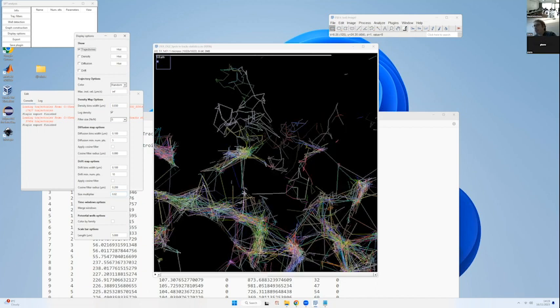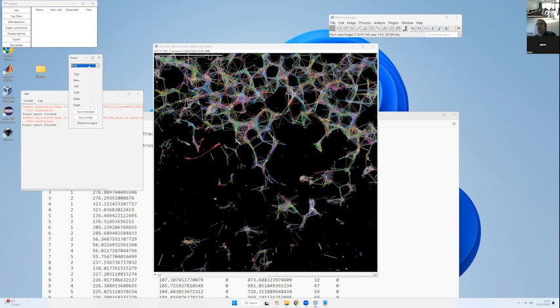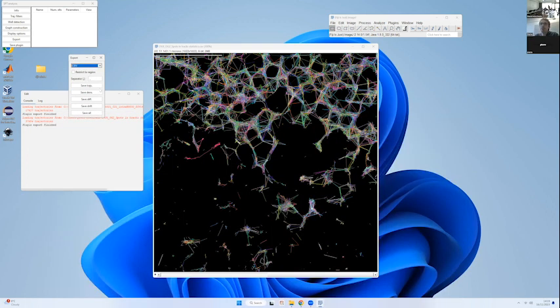One last thing before going to this: if you want to export the maps, you can go to the export button in the main menu, and here you can either save the maps as SVG, so as vector images, or as CSV, so as comma separated values, if you want to read the map and make your own histogram. You have the option. We'll come back to it later.